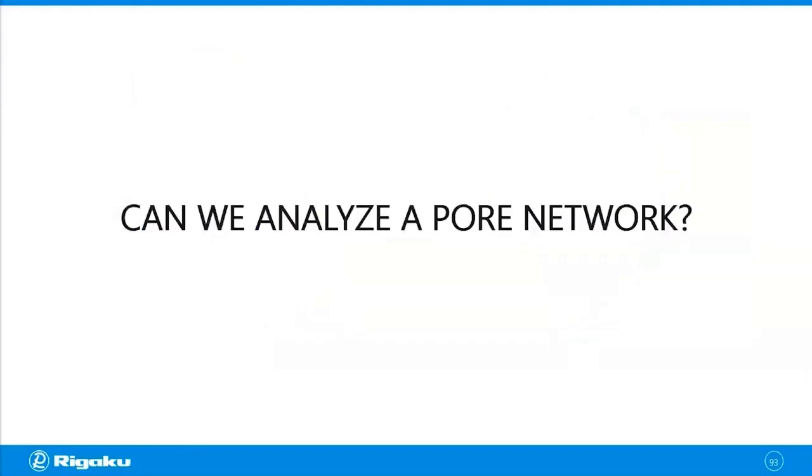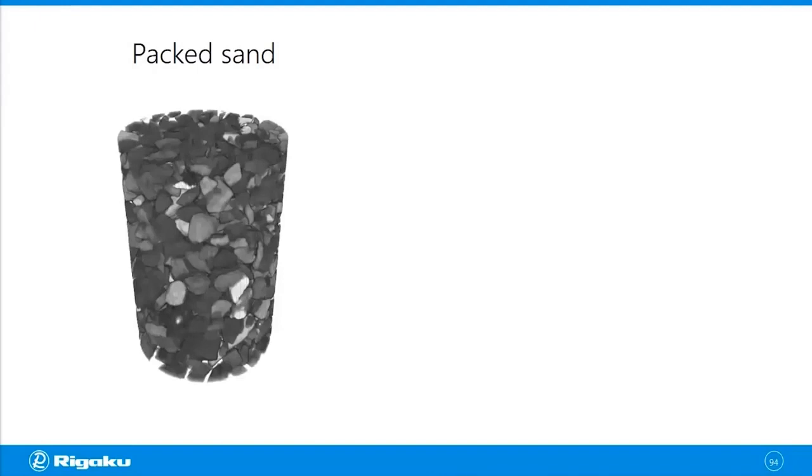Can we analyze a pore network? And yes, and this is one of the, I believe, very common analyses people do with the rocks. So let's take a look at a couple of examples. We're going to use this packed sand as an example.